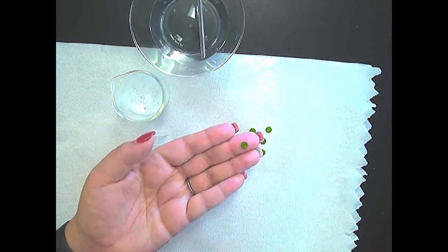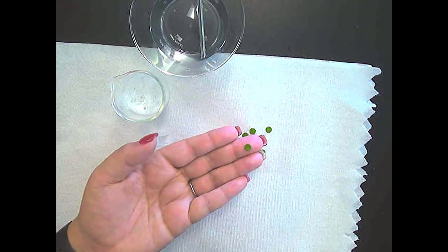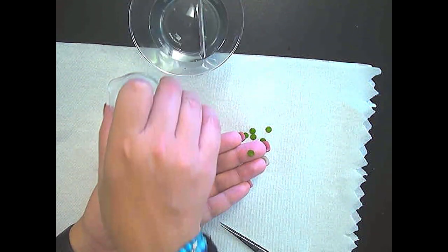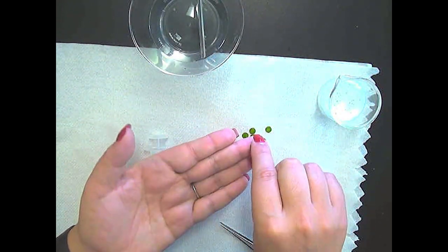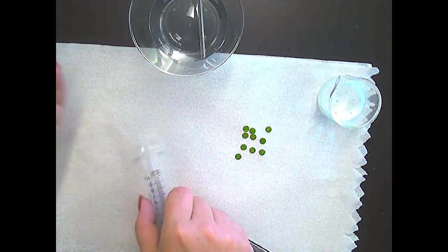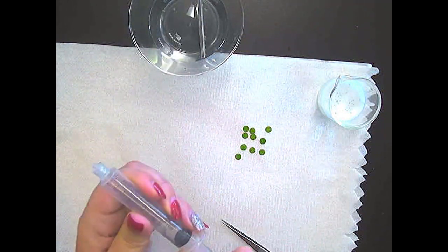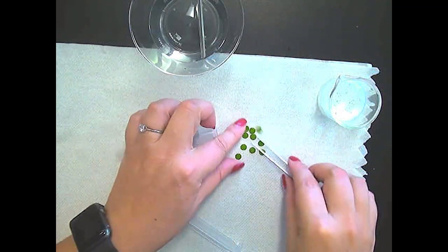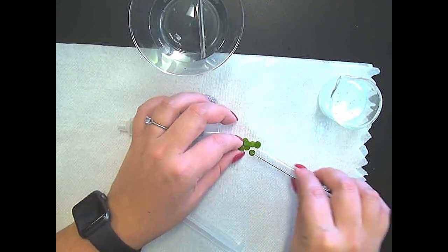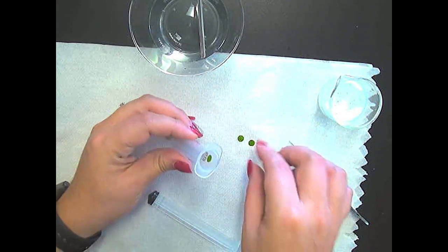We prepared this solution by mixing 1 gram of sodium bicarbonate in 100 milliliters of water, and now I'm going to remove the air from inside the chads themselves. To do that, we need to create a vacuum. So we're going to create a vacuum using just a syringe, removing the plunger and putting the chads carefully into the barrel of our syringe.